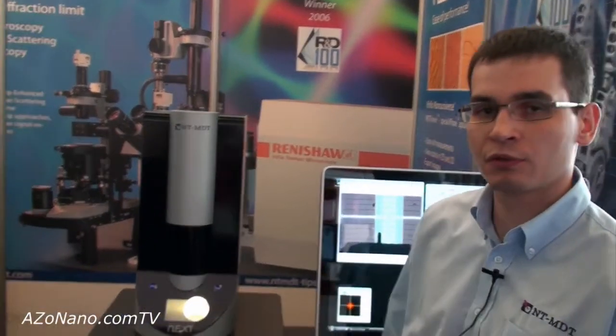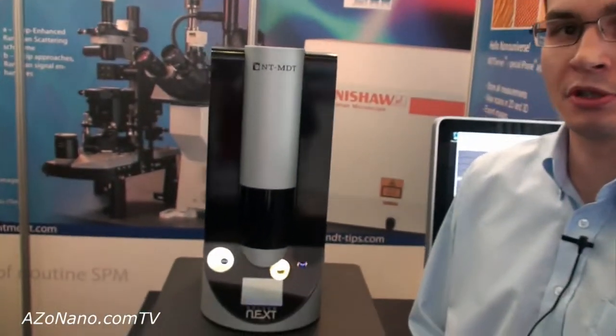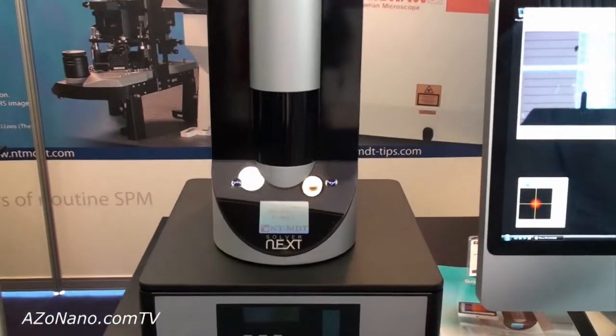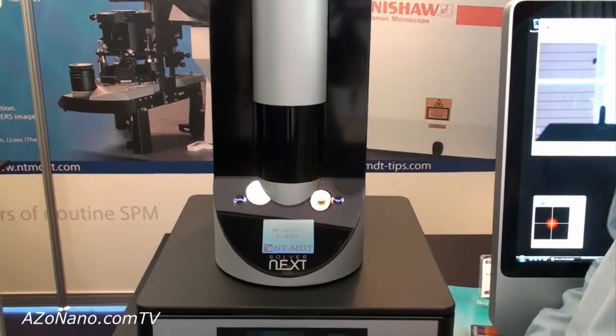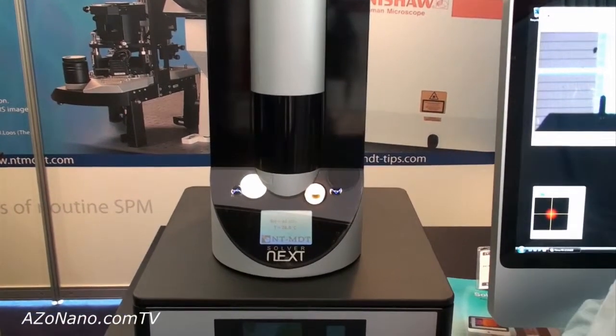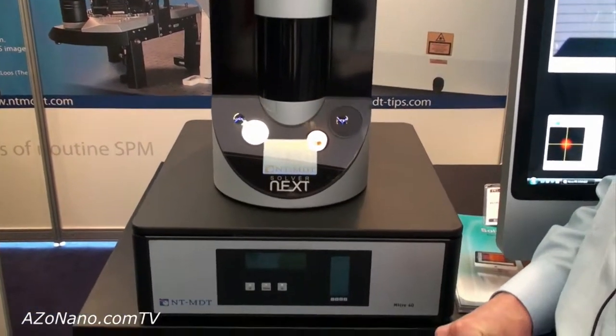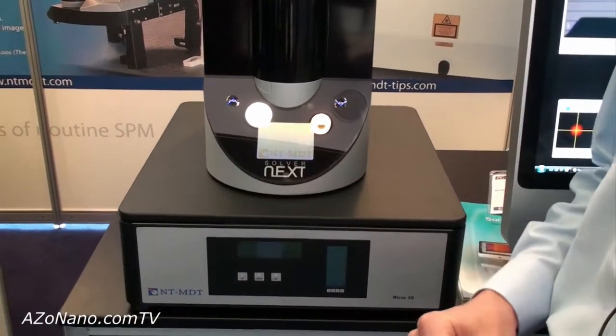Here is our Solvernext, a fully automated desktop SPM system. SPM means atomic force microscopy and scanning tunneling microscopy in this system, and the idea is that the system is fully automated.